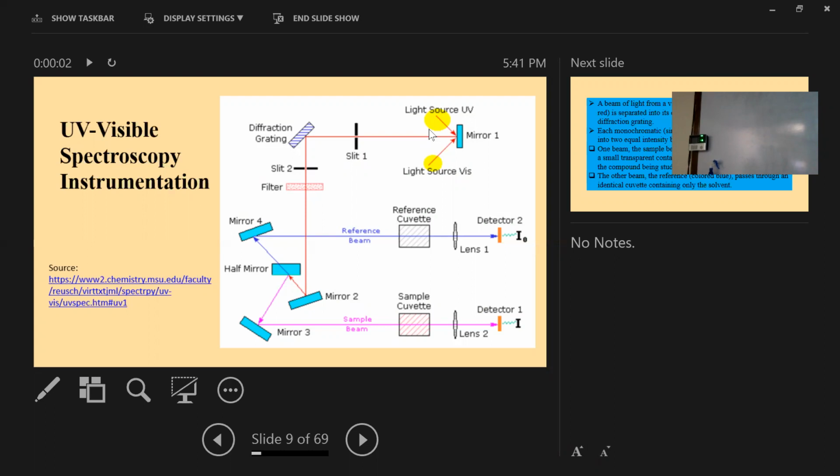I'll show you magic. Okay. Now you can see the light this way. Just only one light. But if I put, maybe you cannot see, this is a pin. The pin from the stapler. That means I'm giving some obstacle in front of the light. Then what happens? Just try to see.